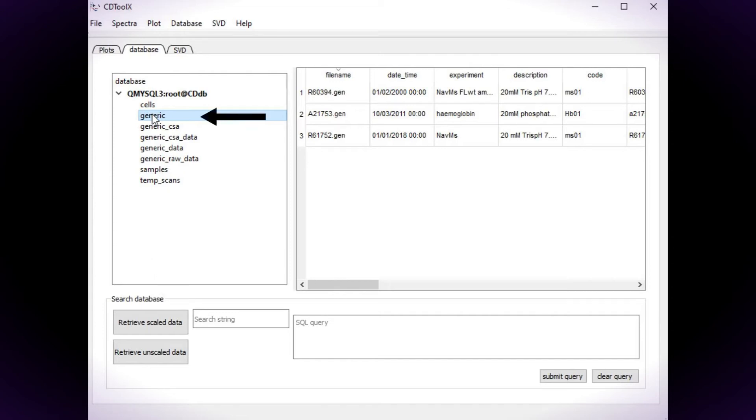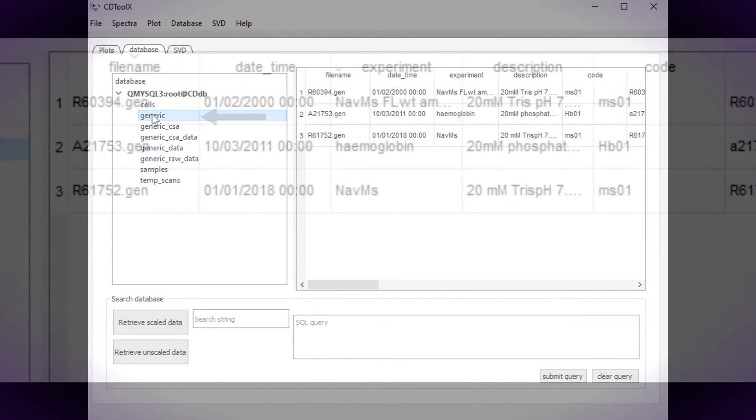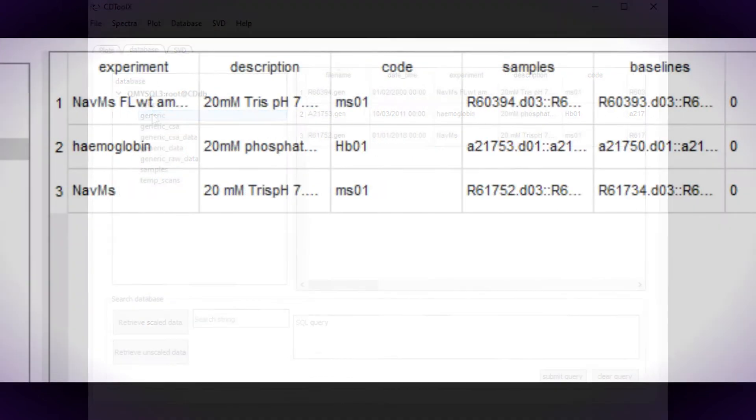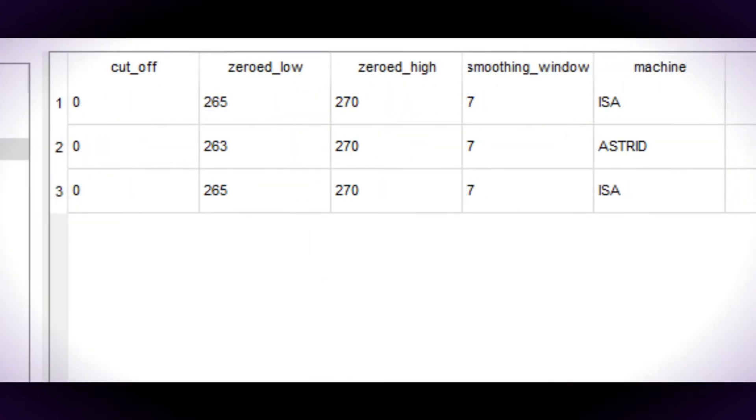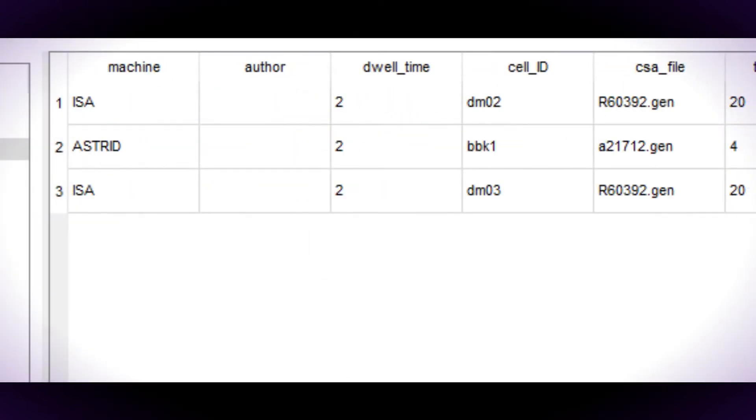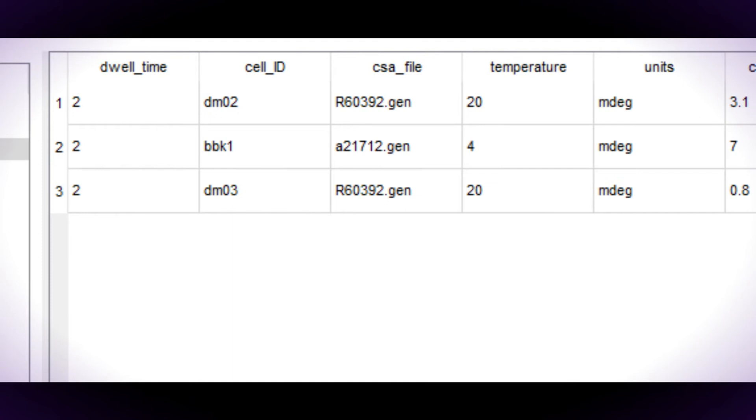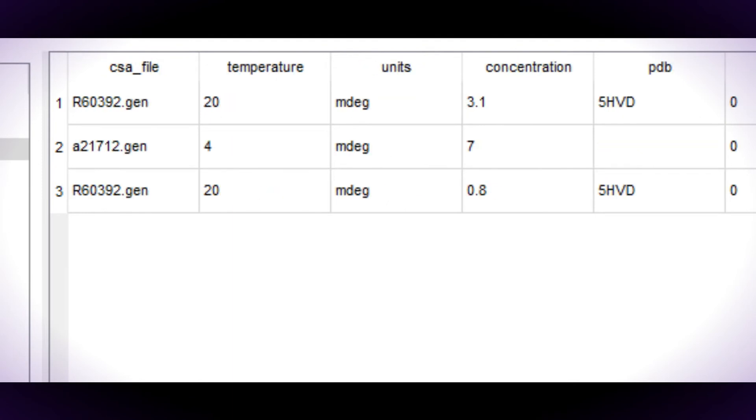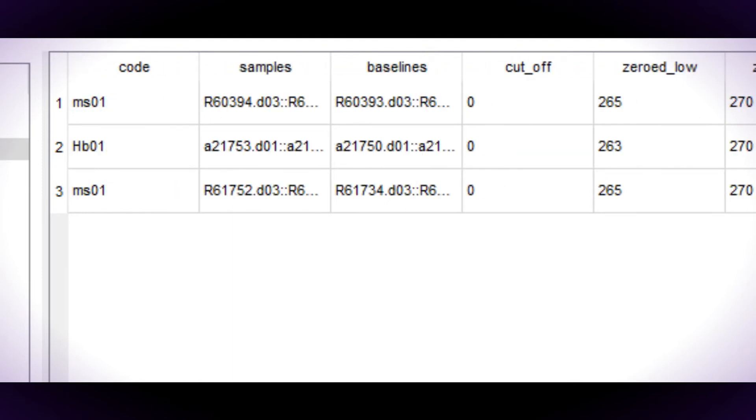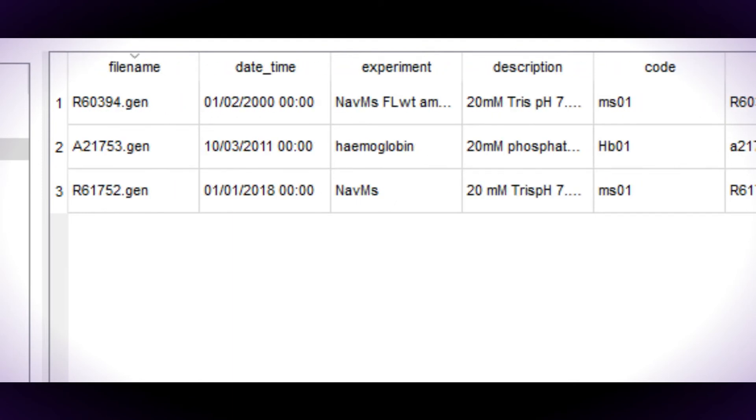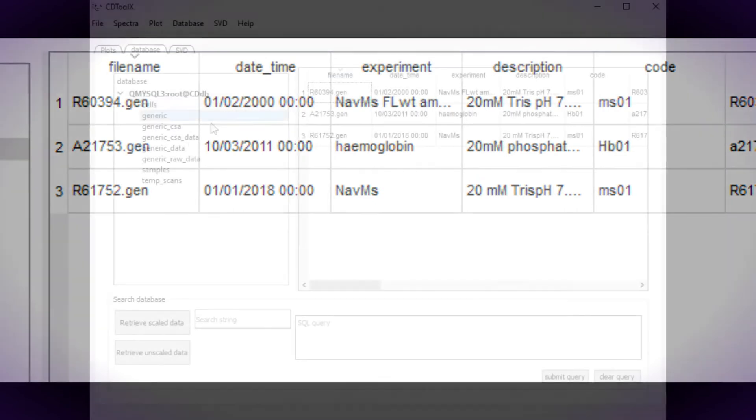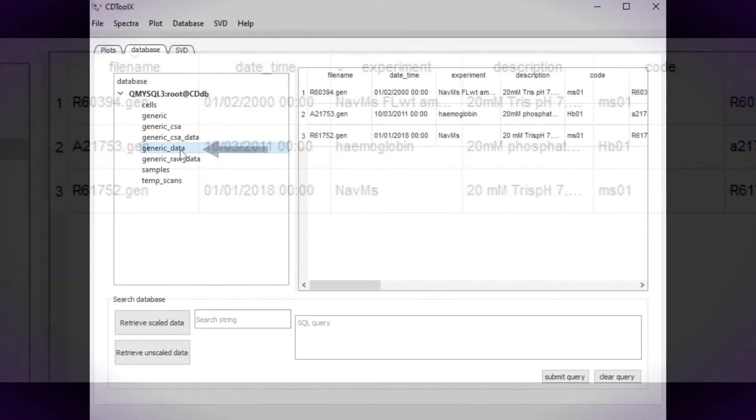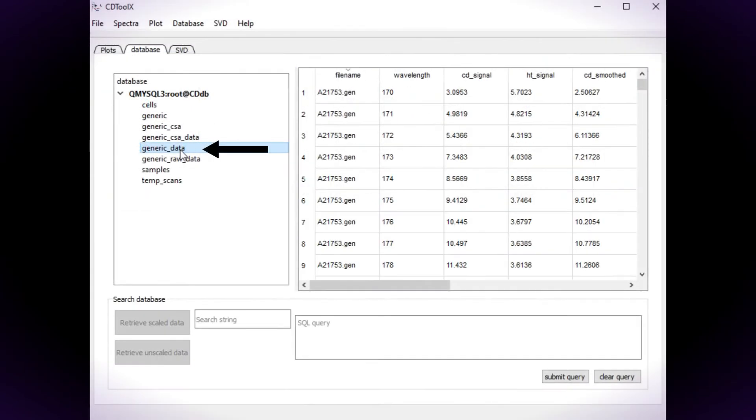The generic table is the main access point for the database and lists the protein spectra that are stored in the database along with the metadata contained in the data file header. The spectral data itself is stored in the generic data table.